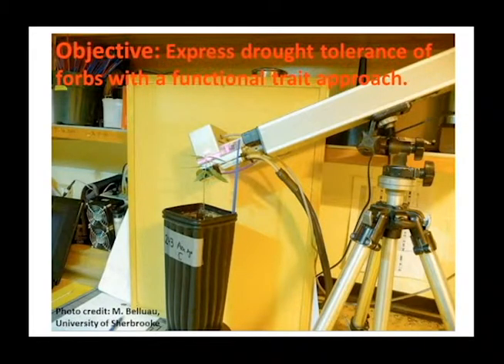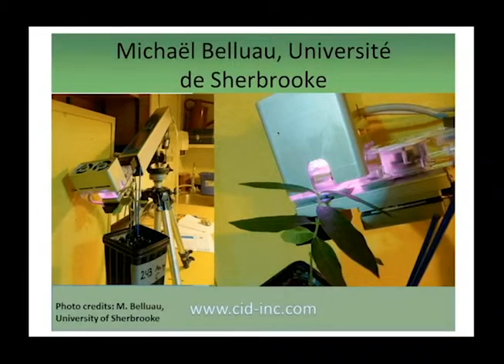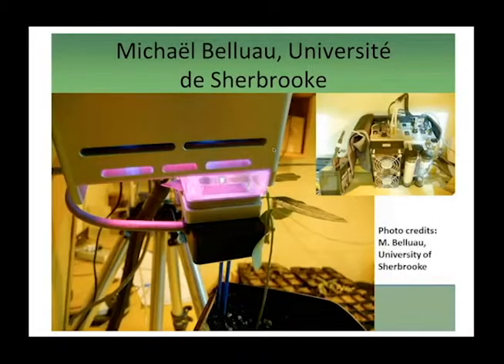He uses the tripod mount to hold the CI340 in place while taking the measurement. Notice the lamp on top of the leaf chamber and the heating cooling pad that is controlling temperature underneath the chamber. So here's another image where we can see the plant in the leaf in the chamber. We can see a close-up of the lamp accessory as well as the heating and cooling pad from the temperature accessory. And here's what the accessory module pack looks like.